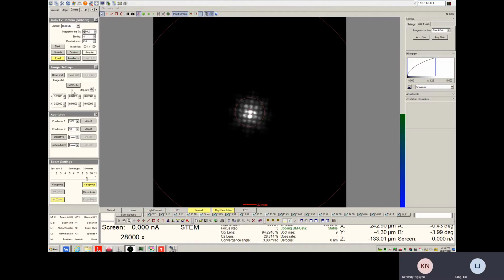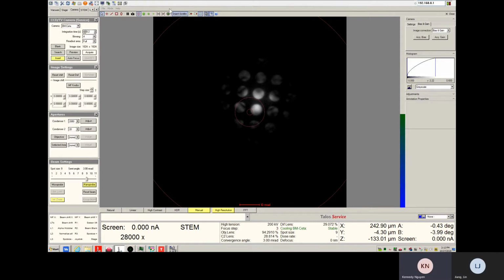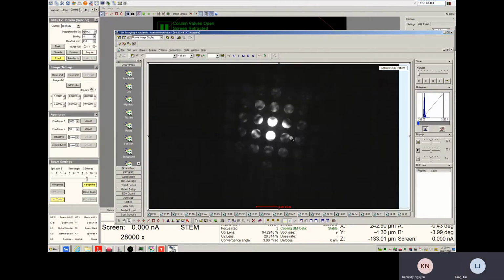Go to stand. Okay. Hit the camera to the screen. Yeah, right.